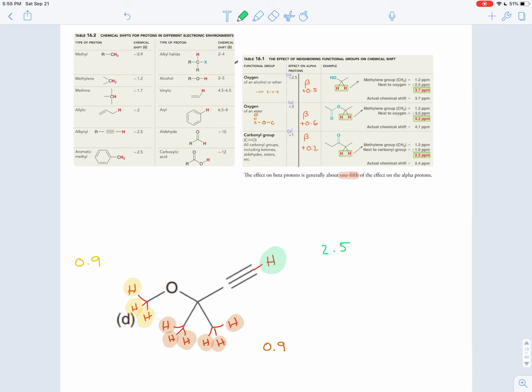So if you put this molecule in a spectrometer, turn on the magnet, shine the radio waves through, you'd expect to get around 3 peaks in the spectrum, 3 shadows cast, when these nuclei in 3 different electronic environments flip from the parallel to the anti-parallel position relative to the external magnetic field. And these are the average places where you'd expect to see the signals, but we have to take into account where the signals would go when they're exposed to electronegative atoms nearby.